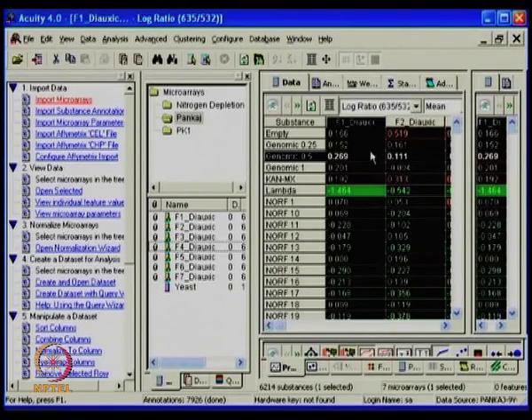One way to look is the numbers, which is a little cumbersome. The other way people like is color. If you carefully observe, the coloring scheme is red, black and green. It's a conventional theme for microarrays; people always represent these colors. So what does each of these color codes mean?